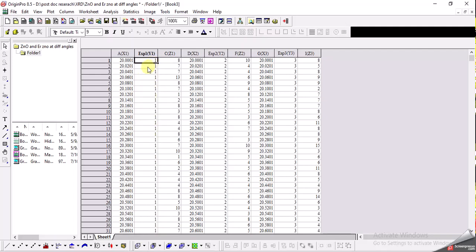I also tried writing down the name of the sample in the y-column but it didn't work and it did not plot. The key point is that you always need to write a numerical value in this column in order to plot a 3D graph.